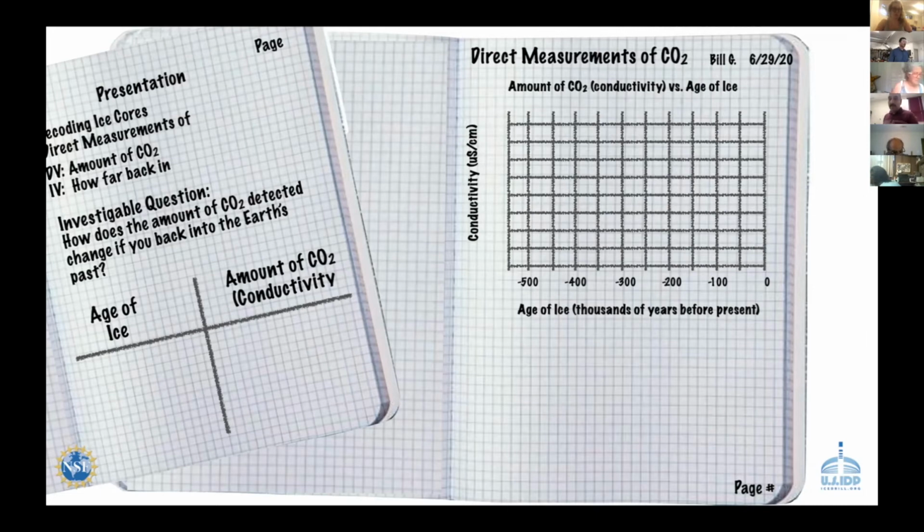Hey, your data is your data. Write your data down. I don't know if mine is set; I set mine up 3 or 4 days ago, so mine might be completely screwed up by now. That's one thing, teacher to teacher, we want to talk about. I think you want to set this up about an hour before you're actually going to do the lab.